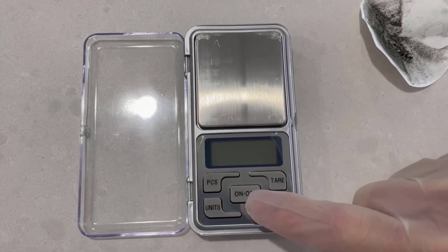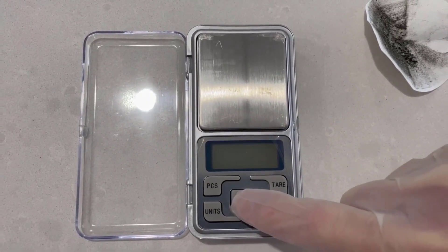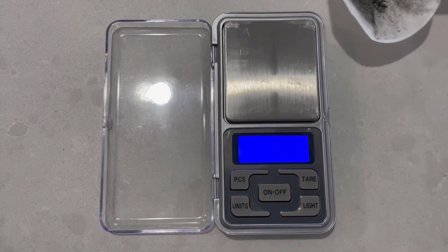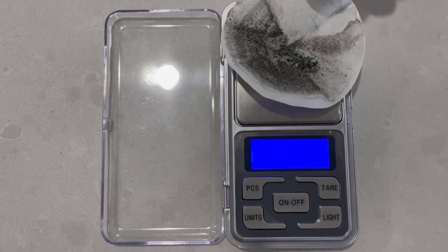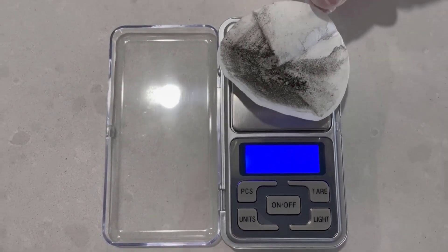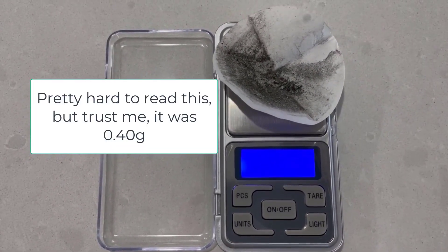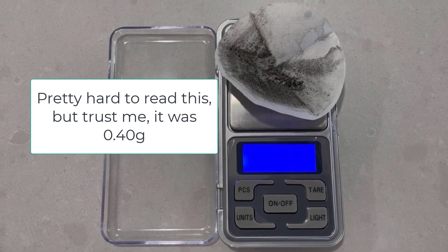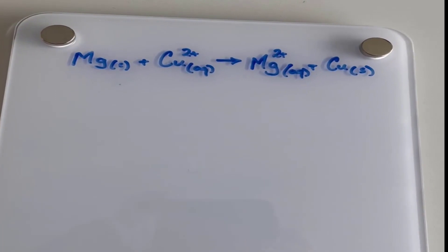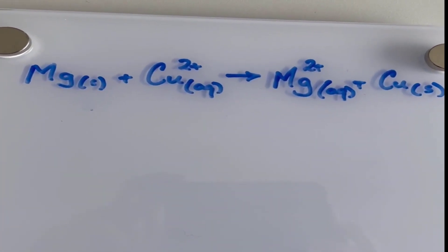Okay, so now that the filter paper is dry, it's time to weigh it. Unfortunately, we've had to bring it inside because there's a bit of wind outside creating a few problems. But let's just see what we get here — 0.40 grams. So let's record that in the little book. Now it's time to see if we can put all of this information together.